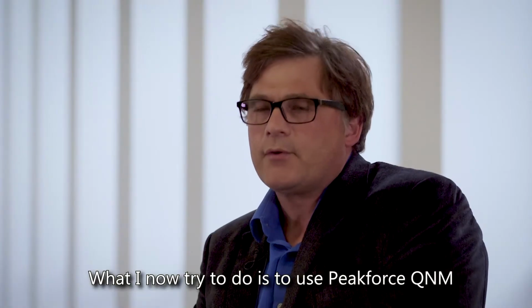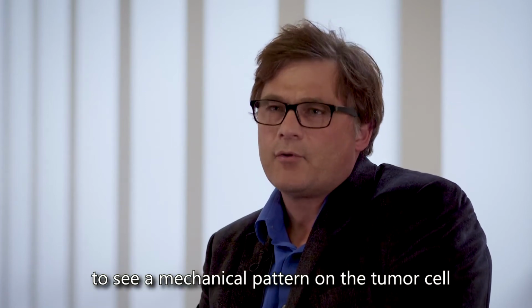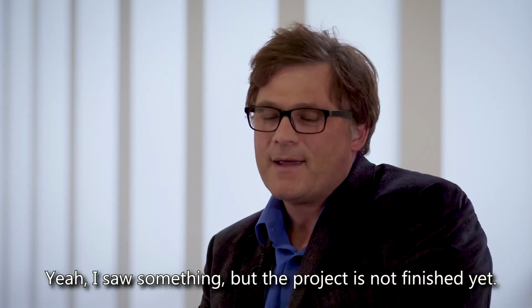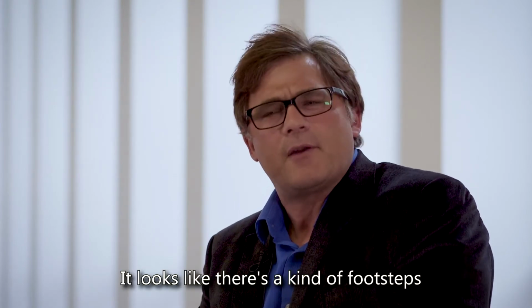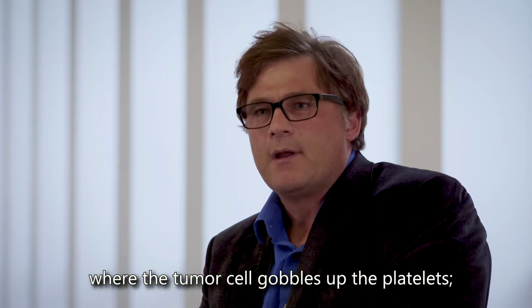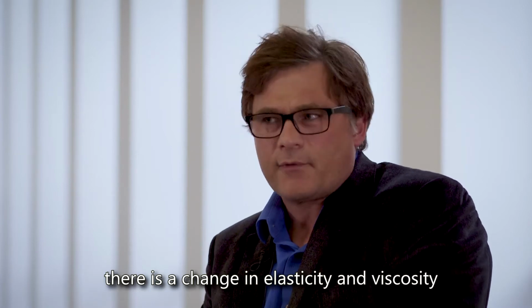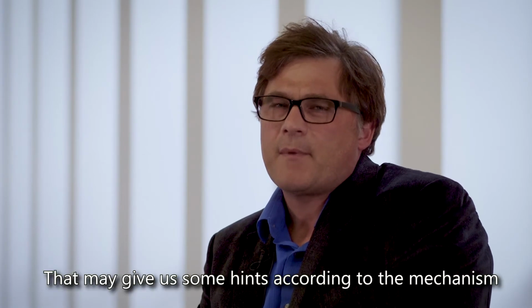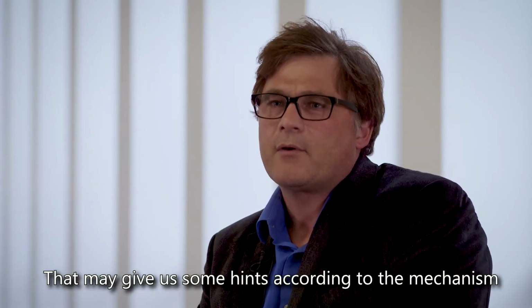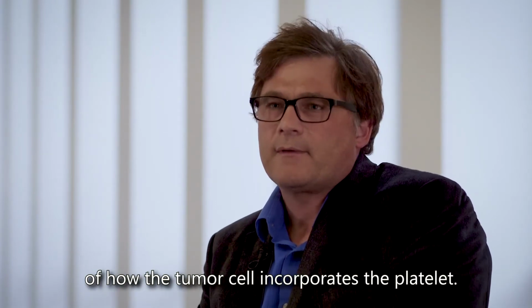What I now try to do is to use peak force QNM to see a mechanical pattern on the tumor cell after interaction with a platelet. And yeah, I saw something, but the project is not finished yet. It looks like there's a kind of footsteps where the tumor cell gobbles up the platelets. There is a change in elasticity and viscosity in the platelet membrane and in the tumor cell membrane, and that may give us some hints about the mechanism of how the tumor cell incorporates the platelet.